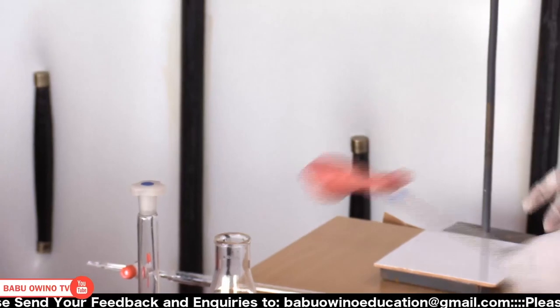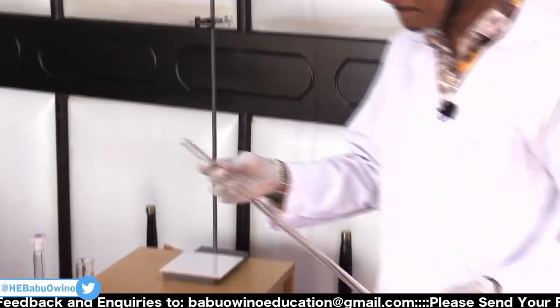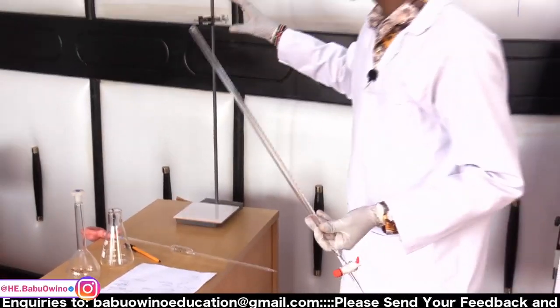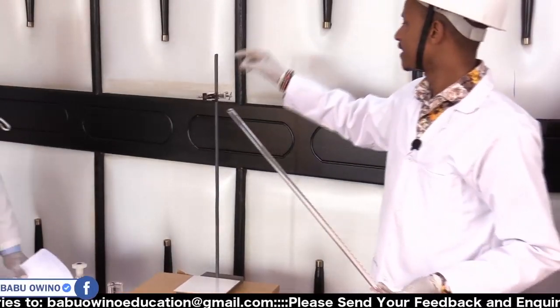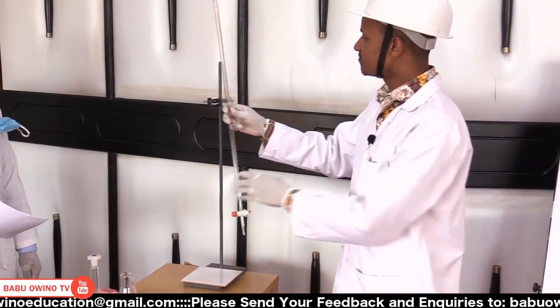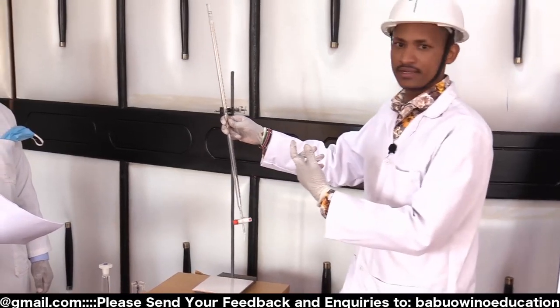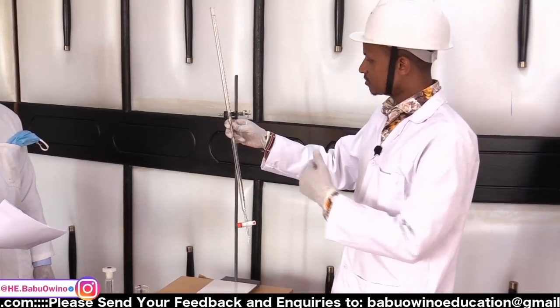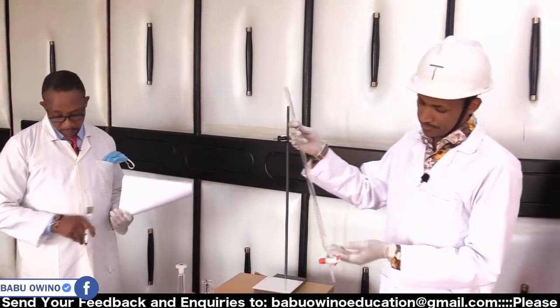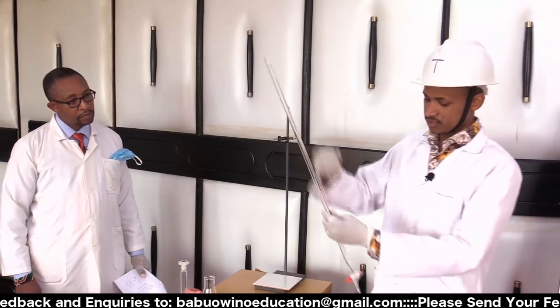After that, we have our burette. As you can see, our burette is normally put on a clamp. A clamp is here, then we have a stand. You put it firmly on a clamp, you ensure that you don't break the burette. The burette is calibrated from 0 to 50.